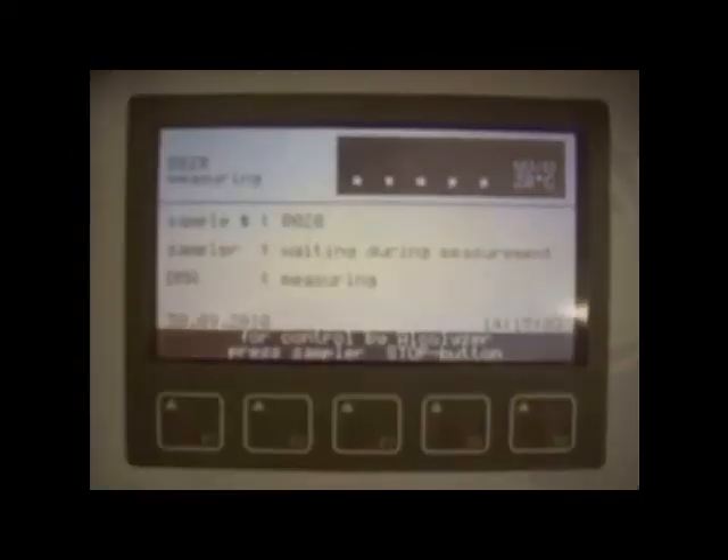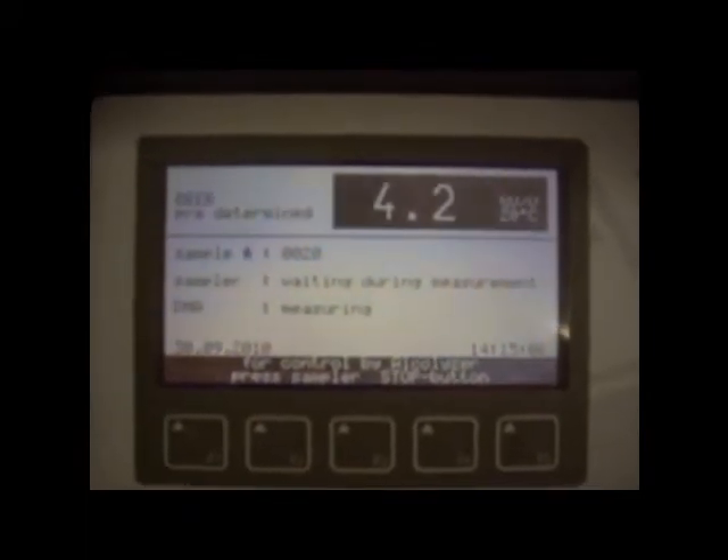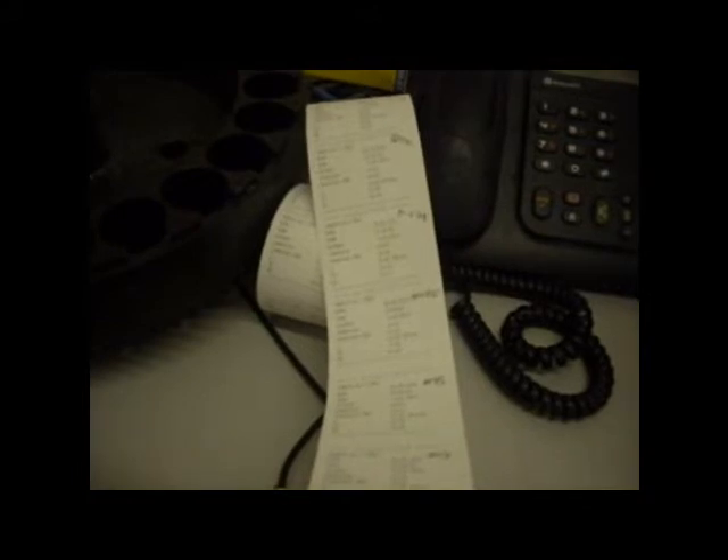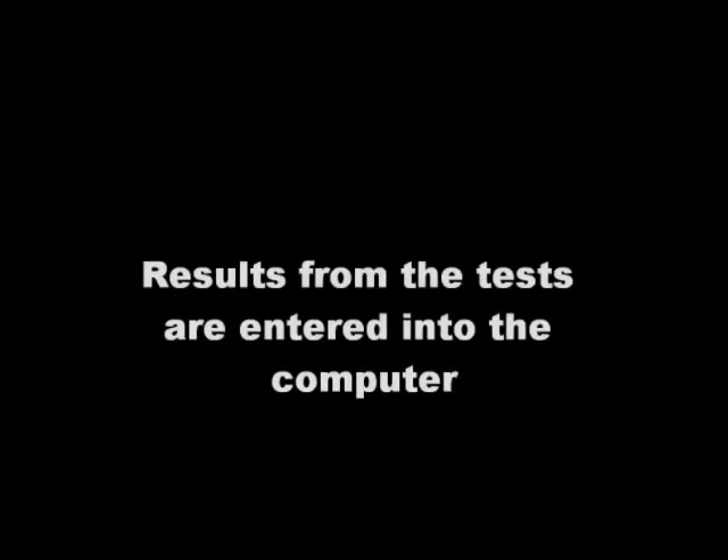You can see right now it's going through one of the beers. It hasn't gotten the results yet, but we do read the results here and we keep track of every beer that goes through for the day. The program being used here checks to make sure that every beer has the proper gravity, pH, or alcohol and is within the right guidelines so that they can have consistency.